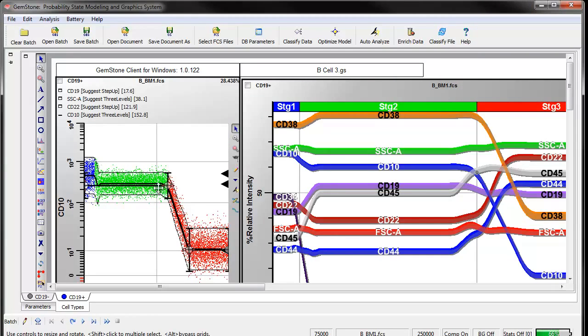So let's just take a look at CD10 for a moment. And if I take this control definition point, or CDP, and move it around, you can see that as I move this away from the next CDP, it goes a certain distance and then no more, the distance between these. Mm-hmm. And that's what we use to model the transition from one state to another.